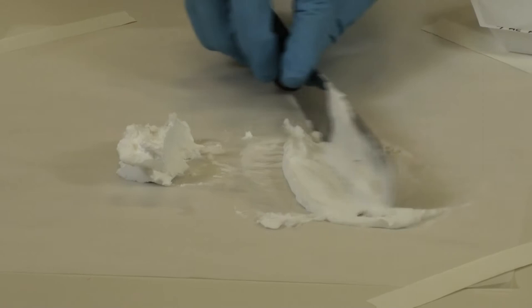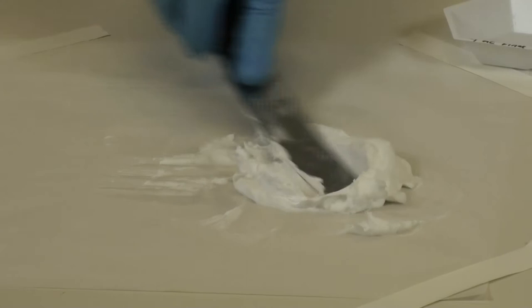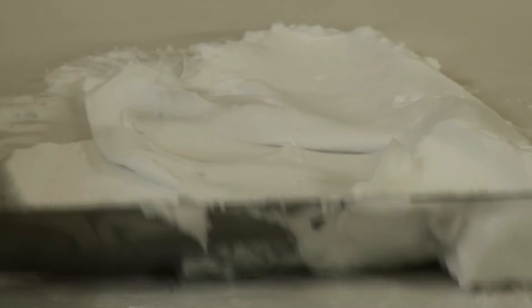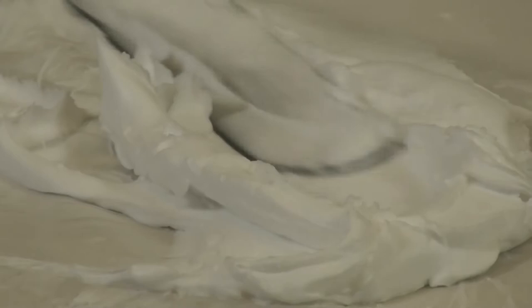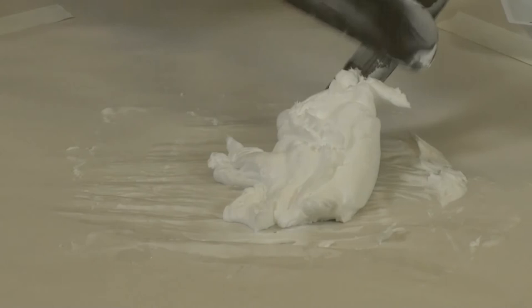Go ahead and pull the rest of it in. And now it's just a matter of making sure that cream is uniform throughout and your active ingredients are uniformly mixed. Pour it in together one final time. Once you think it's uniformly mixed, you can stop the spatulation procedure.